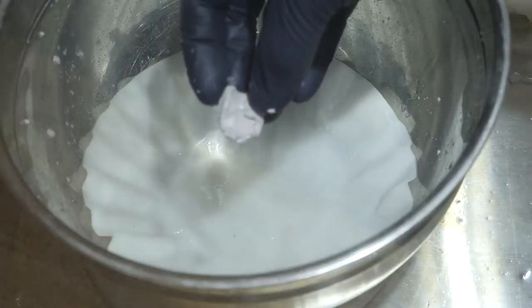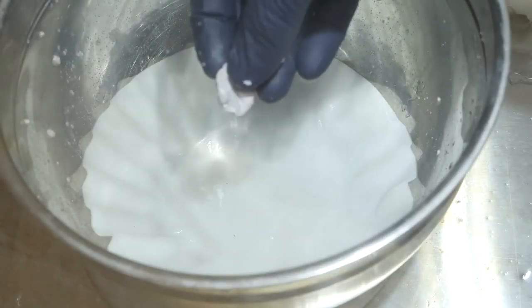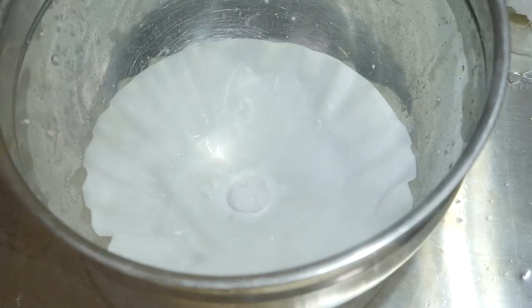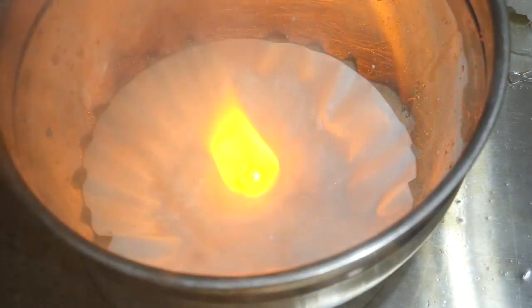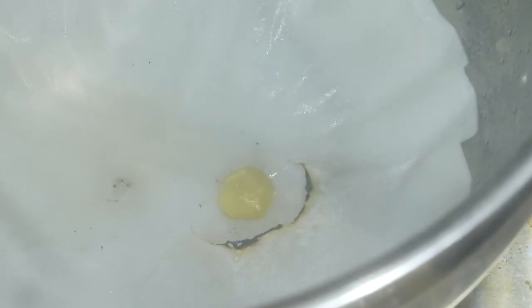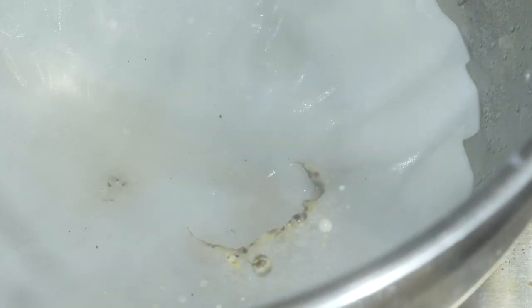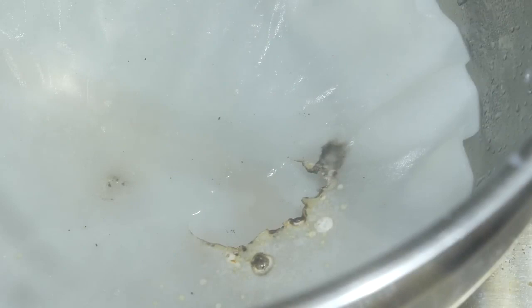Watch this. Okay, here's our chunk of sodium. I'm just going to drop it on this filter paper in water. 3, 2, 1. Whoa. It's completely clear now. Look at that. Whoa. So we actually end up with a crystal clear drop here that suddenly explodes at the end.